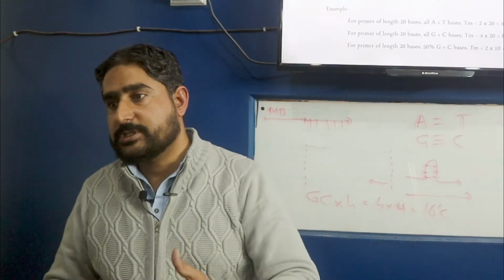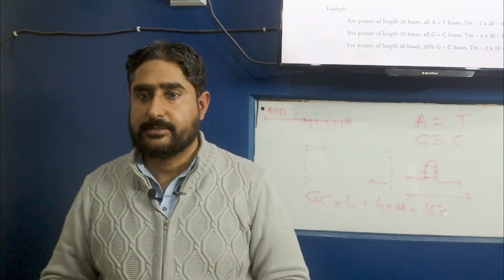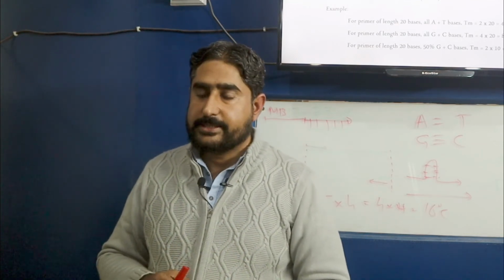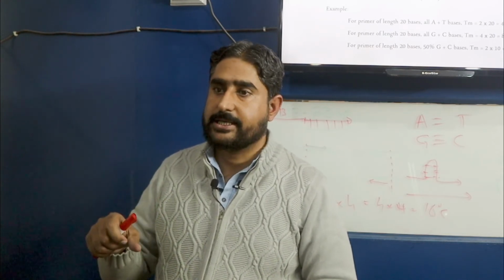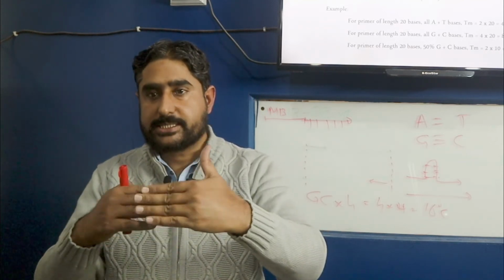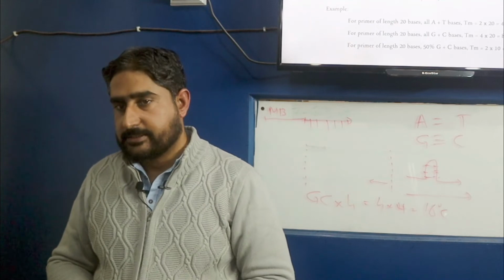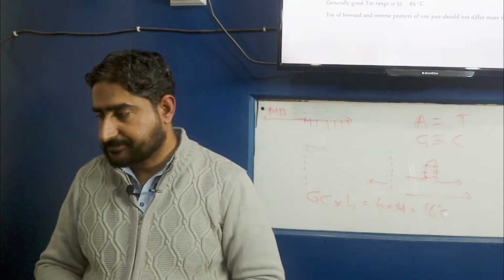And if we have more G plus C content, that means we are adding complexity in the primers, and that will have difficulty in annealing to its particular temperature, because there have been recent studies which say that in those areas which have higher G plus C content, the double base pairing turns into other structures of DNA, and that's one reason that there are multiple other structures formed in the DNA that basically hinder the annealing of primers to those regions.